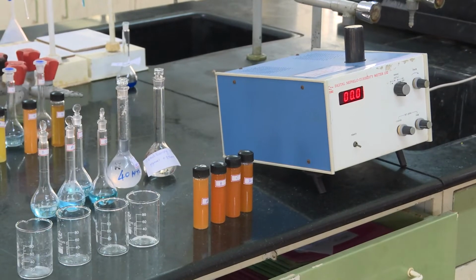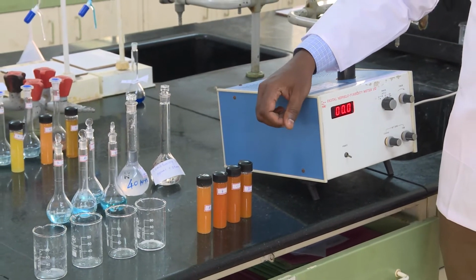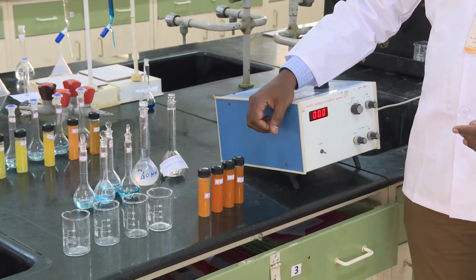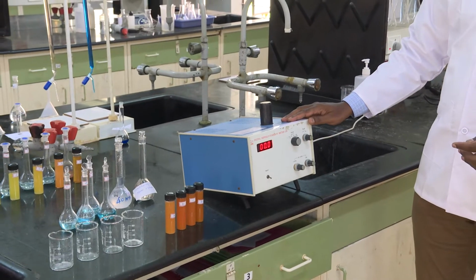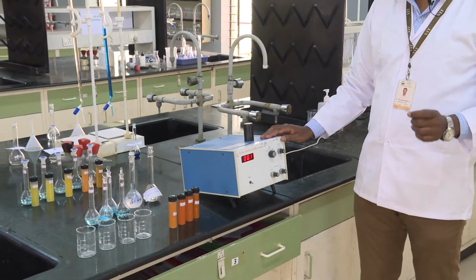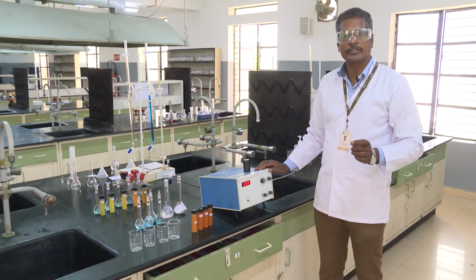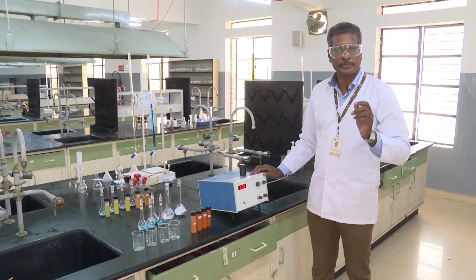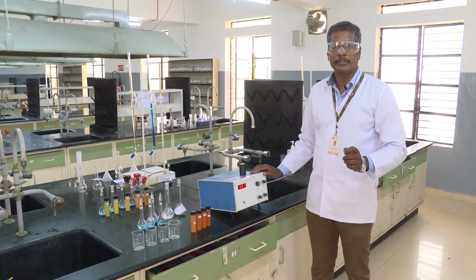So once we complete the second part of the experiment, we have seen the reddish color of the copper oxide nanoparticles. Our next task is to measure the turbidity of this sample, and this is the turbidity instrument. The basic principle involved is that the turbidity is related to the size of the particle, and it also determines the concentration. The higher the concentration of the suspension that is present, the higher the turbidity, and the larger the particle, the higher the turbidity.